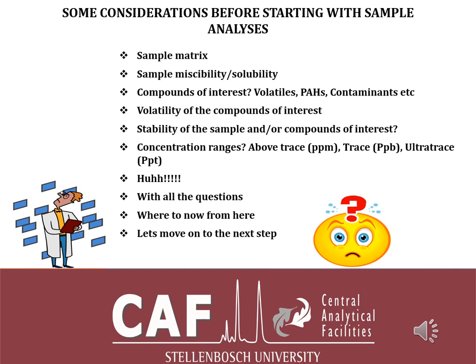Now, there's been a lot to consider. So with all these questions, one may ask, where do we go from here? All those questions that one has to think about are, I believe, very crucial and very important. So I will go now into the next slide and talk about some sample prep techniques.